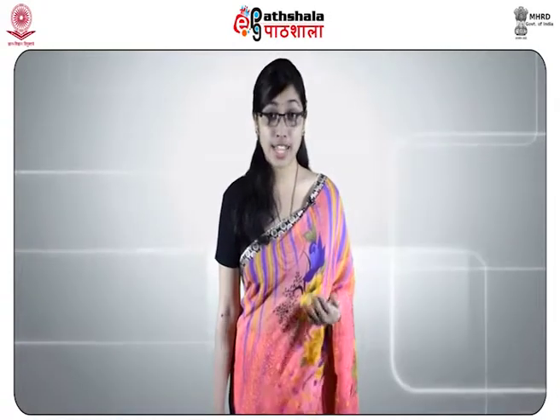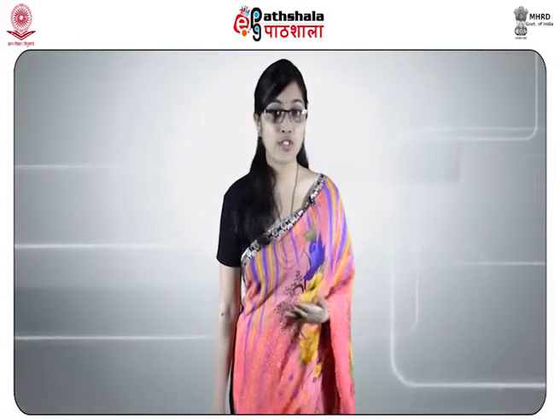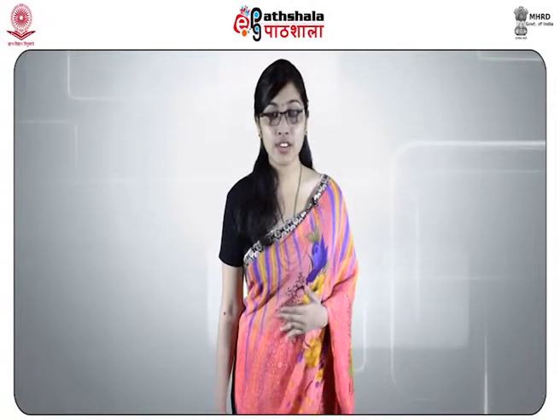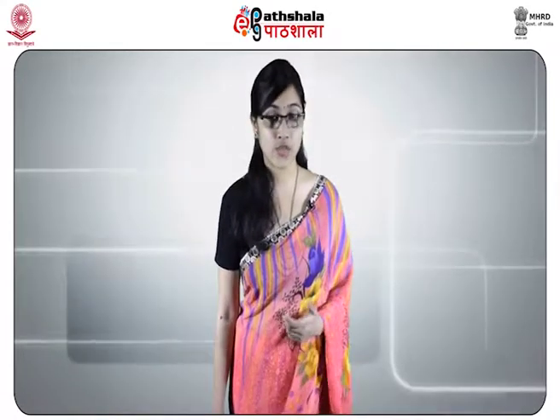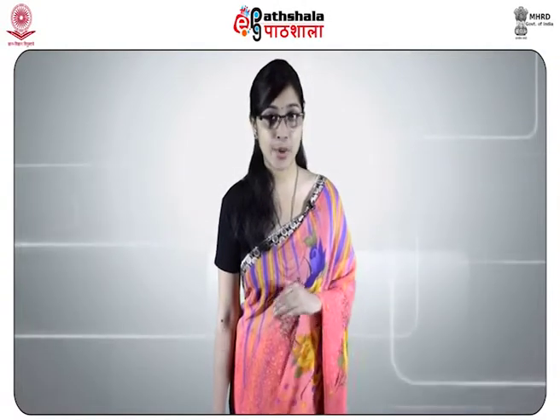The microscopic examination reveals the color and the character, whether they are curly, wavy, soft or coarse, whether the ends are frayed or have tips, or whether the roots are present or not. The ratio of diameters of the medulla and the hair measured at the thickest point is known as the medullary index. Vacuoles give characteristic formations in certain species which are useful in their identification. They are also known as air bubbles.